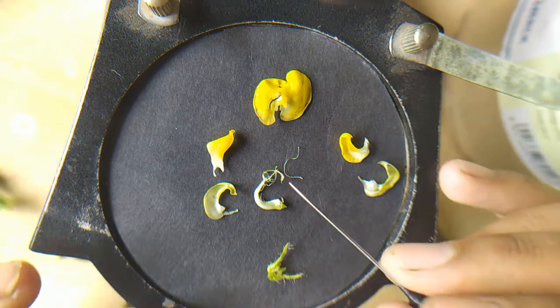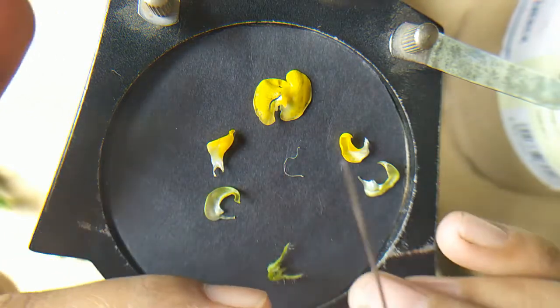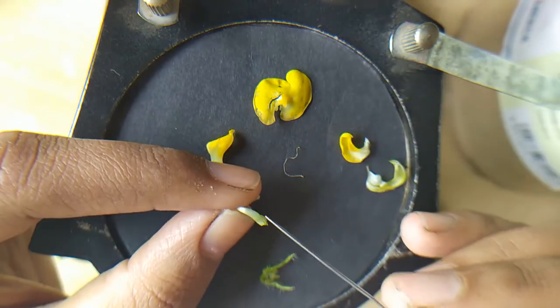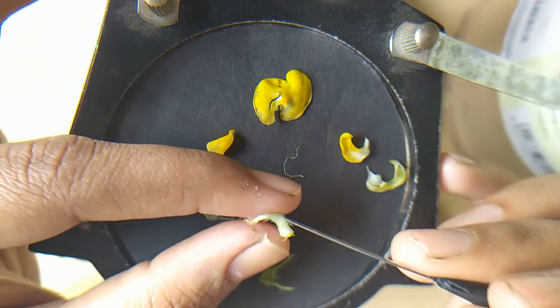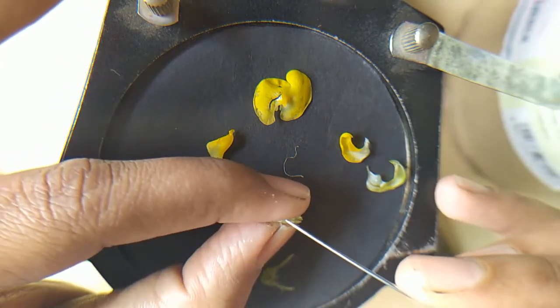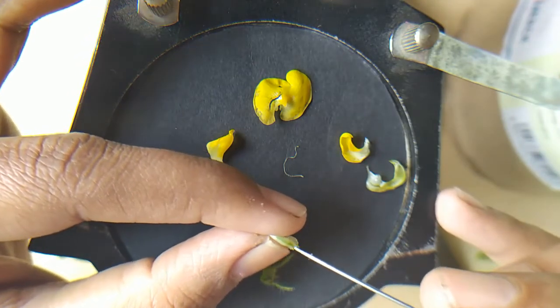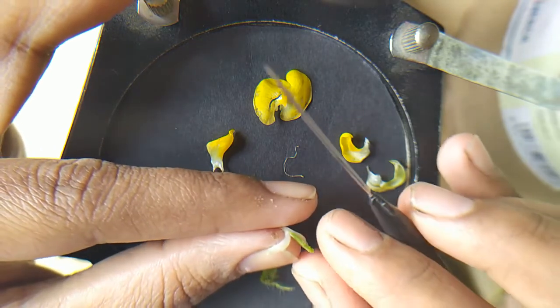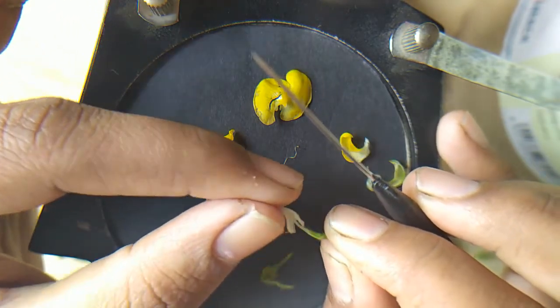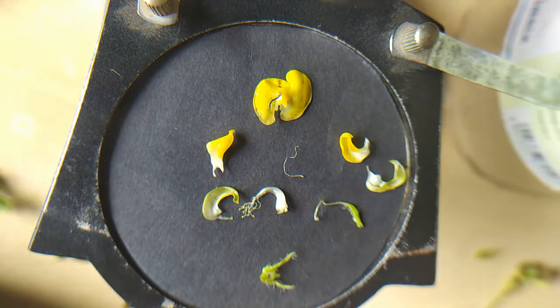Now we have to remove the gynoecium. The gynoecium is green in color and thick in appearance, so it is easy to identify in the case of urad bean. Give a cut from the back side of that bunch of 9 anthers and then separate out our gynoecium. Okay, now it is separated, and care should be taken that the gynoecium should not break into pieces.